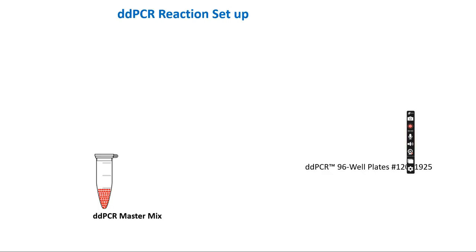So the first thing we do in the ddPCR reaction setup is make everything into a mix in one container. I'll start with the ddPCR Supermix for Probes. You can buy this from Bio-Rad. Since I'm showing the Bio-Rad one, I'm not marketing; I'm just using Bio-Rad right now, so I'm giving an example.